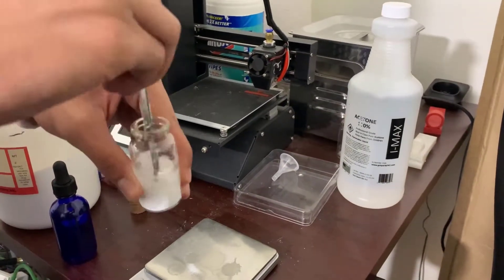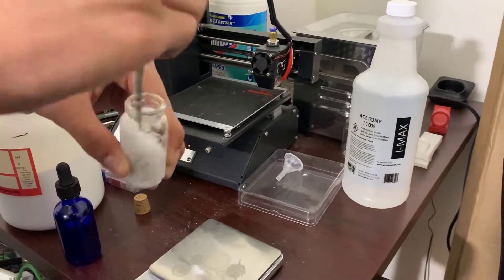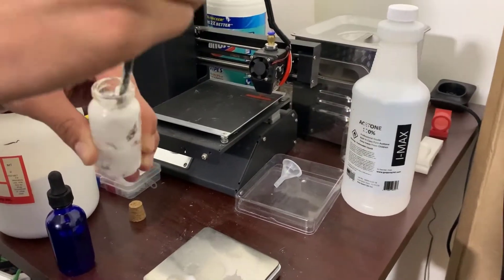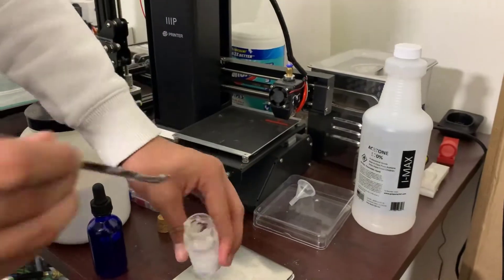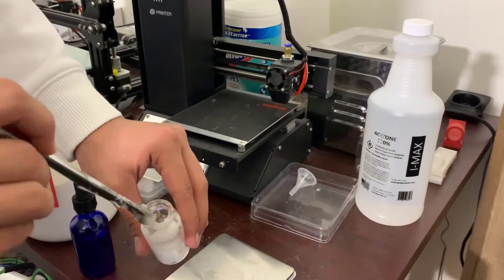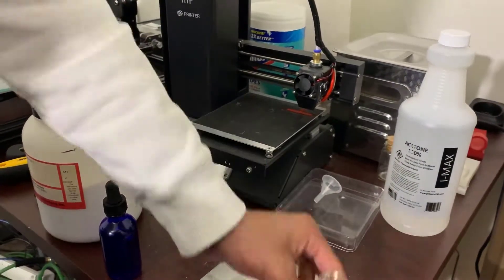After you have created the solution you are going to want to mix together the cellulose acetate and the acetone. This will speed up the process of getting a proper viscosity bio ink. After you have done so, you are going to want to let it sit for an hour so it can reach that proper viscosity.